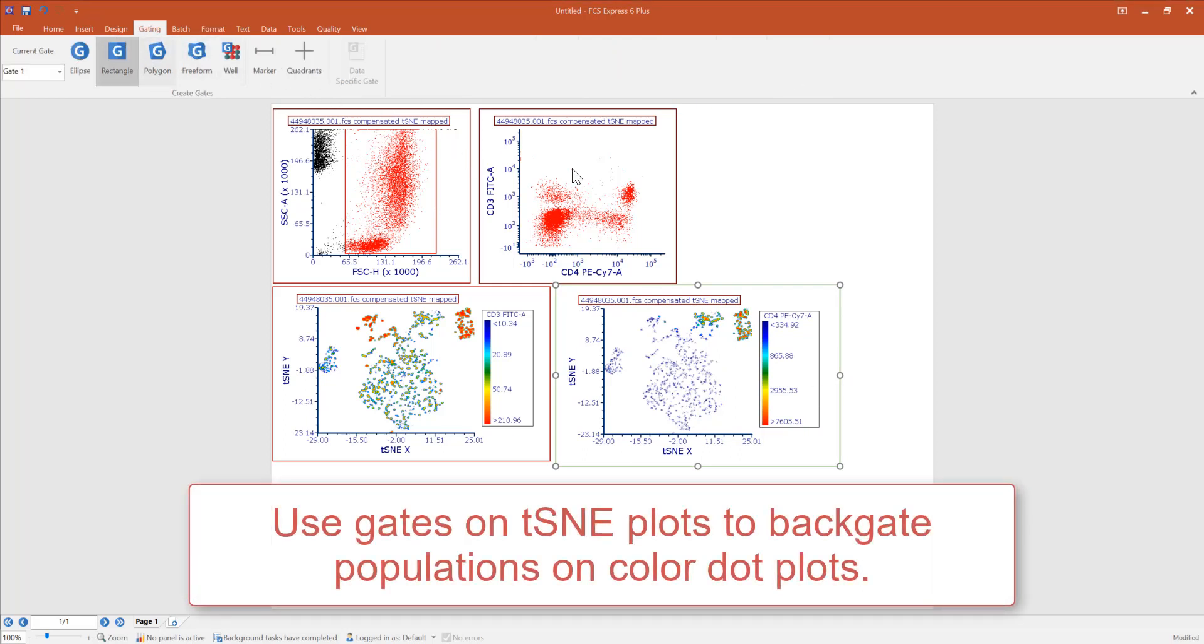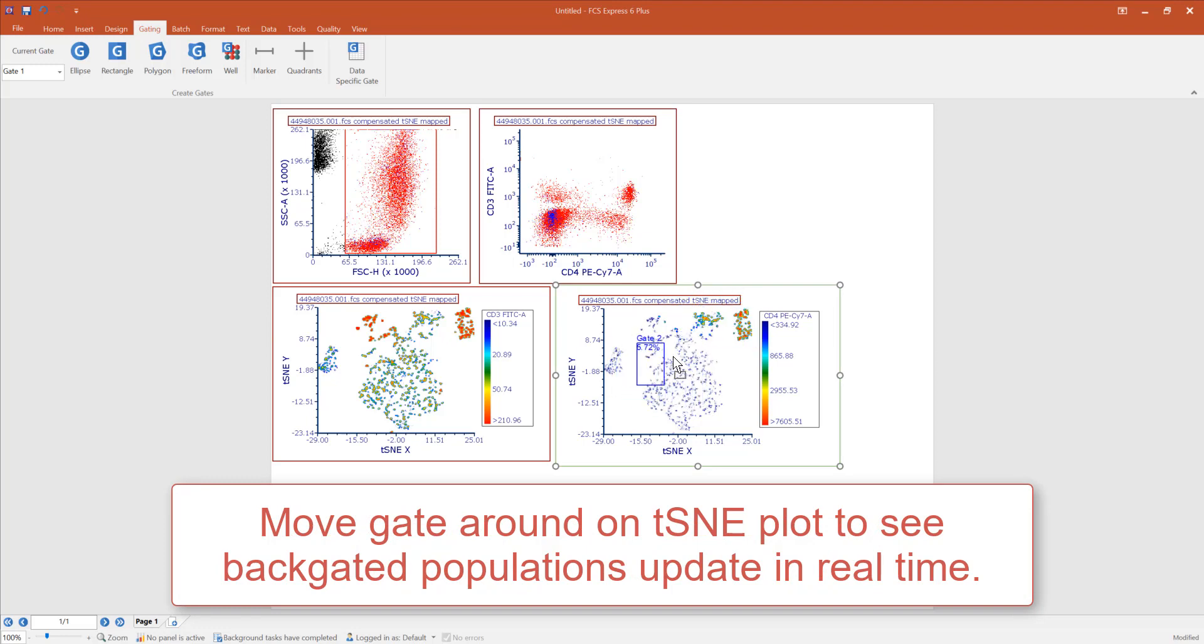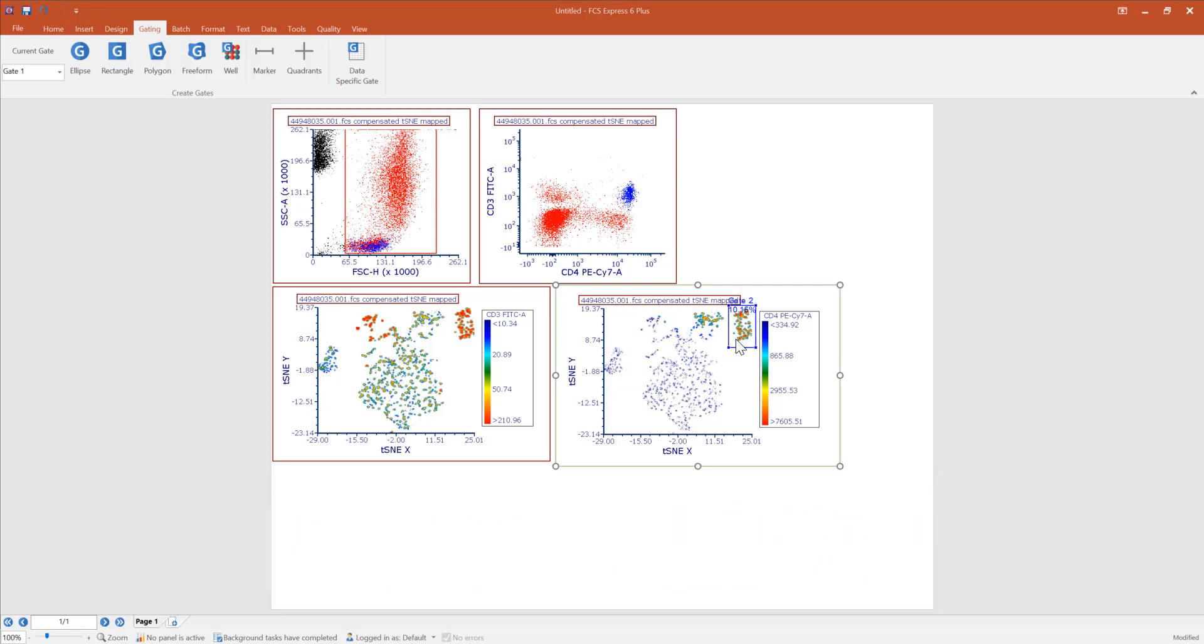Gates may be created on t-SNE plots and used to view back gated populations on color dot plots. Moving the gate on the t-SNE plot will result in real-time updates on the back gated color dot plots.